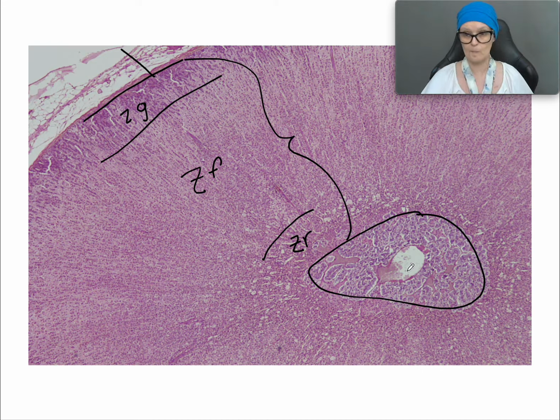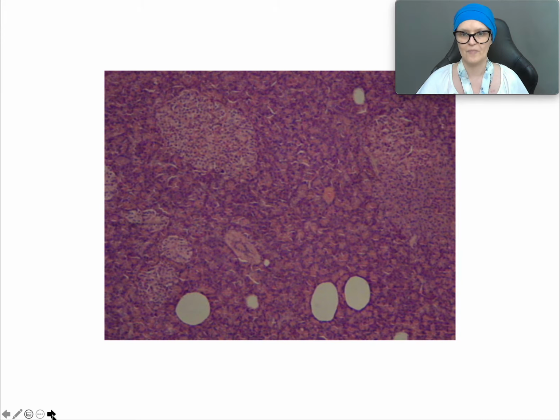Okay. Adrenal capsule, adrenal cortex, adrenal capsule, and adrenal medulla. There we go. Sort of labeled. Okay, name that organ. This is the pancreas, and I've never heard anyone call it the pancreas gland, so we're just going with pancreas.